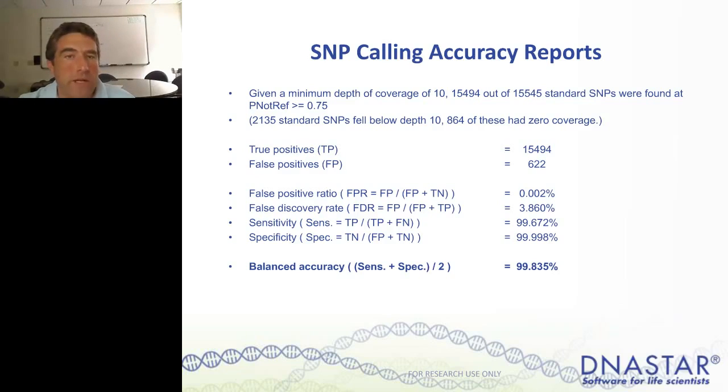We are also working to generate some of the accuracy reports on whole genome and get all the statistics calculated for whole genome accuracy. So in areas that may not be as optimized as exome capture, but in some of the more difficult to assemble areas that are found in the genome.